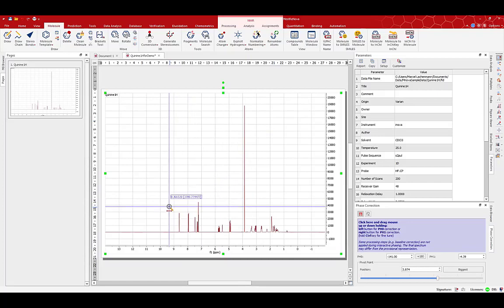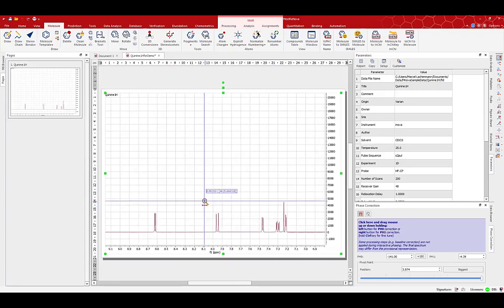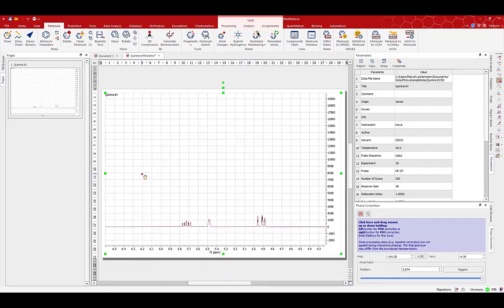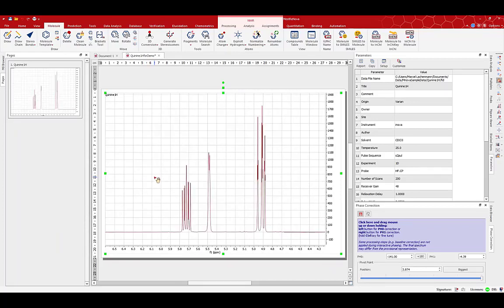For example, if you want to look at a particular region of the spectrum, just hit Z to zoom in. If you want to look at a slightly different region, you can hit P and drag over to get to that new region of interest. Peak's too low? Just hit H to scale to the largest visible peak. Want to add some text annotations? T is your friend.